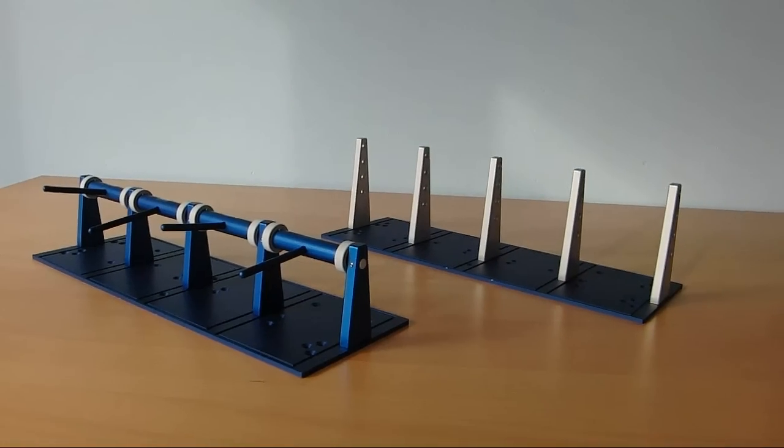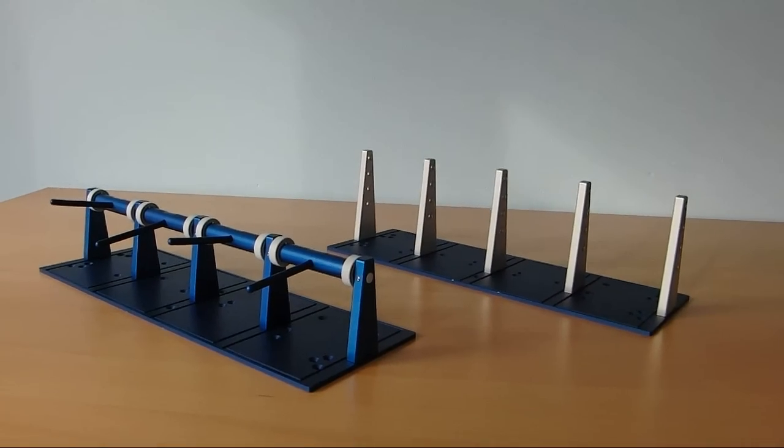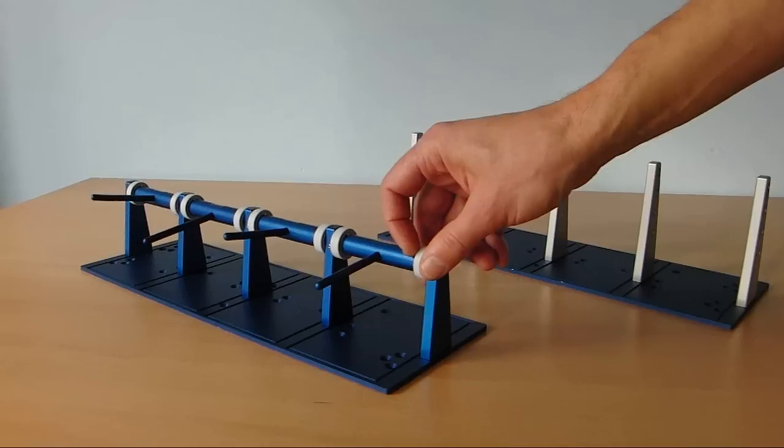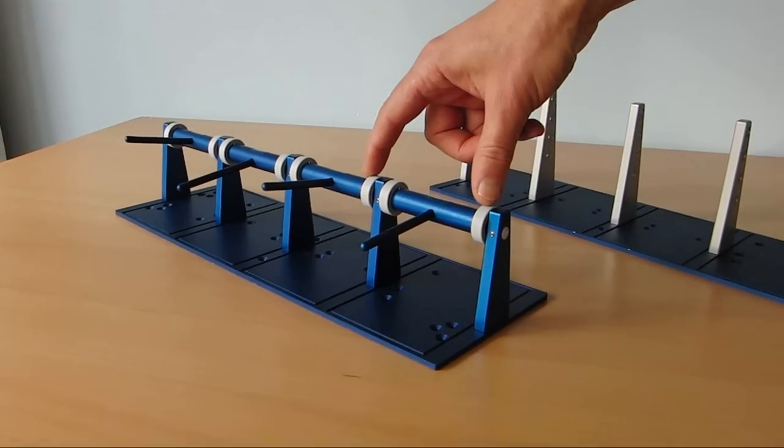We supply two types of clamp system. One, as shown here, is specifically meant for deep well microtiter plates.